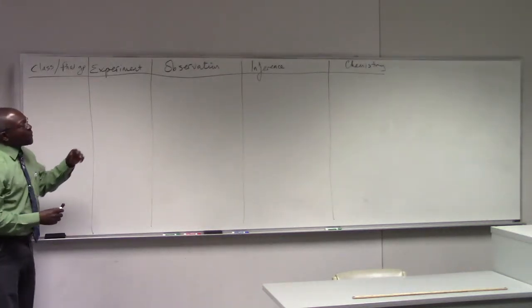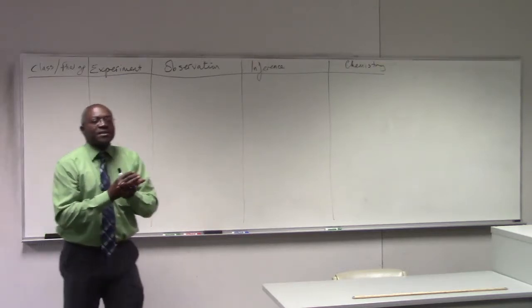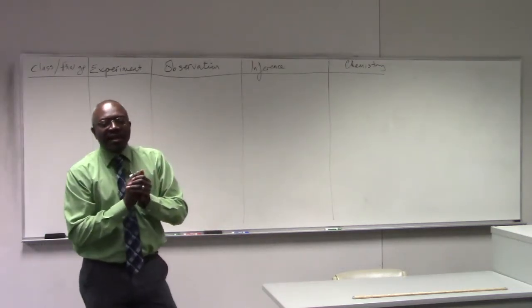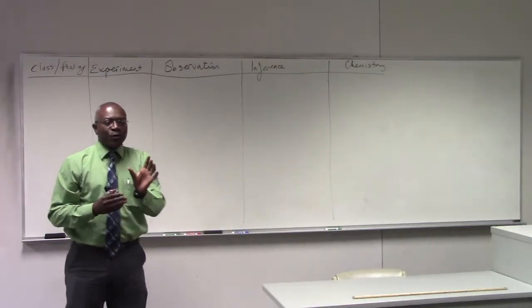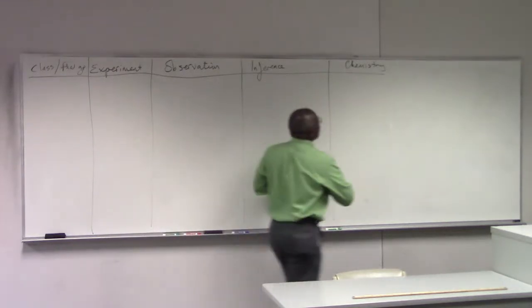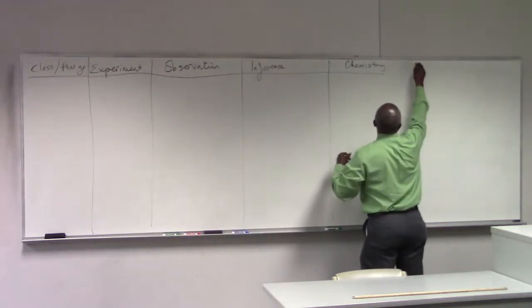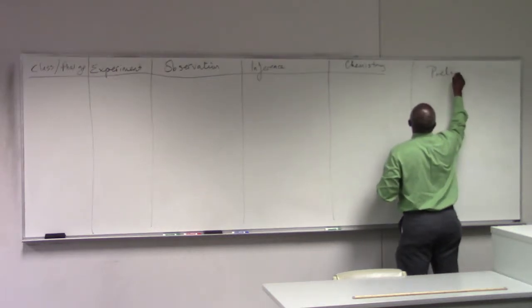So before we get into the table of the different tests, I will point out that typically what happens is the organic chemist will observe the sample and do what we call preliminary tests. So before we get into this, let me just talk a little bit about preliminary tests.